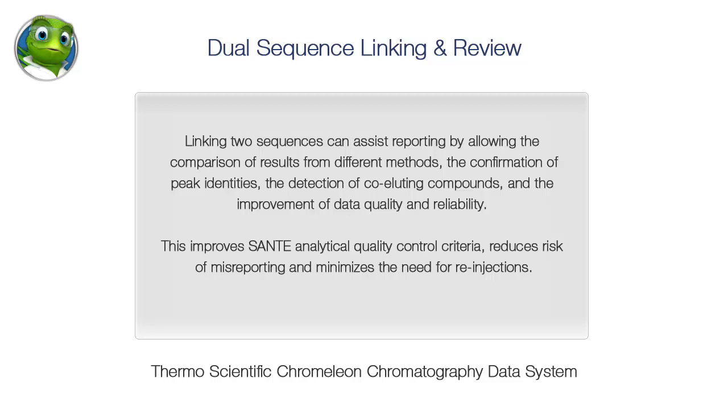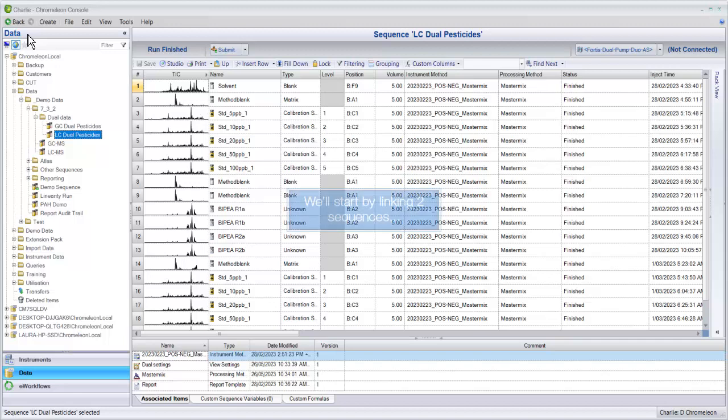This improves Sante analytical quality control criteria, reduces risk of misreporting and minimizes the need for reinjections. We'll start by linking two sequences.